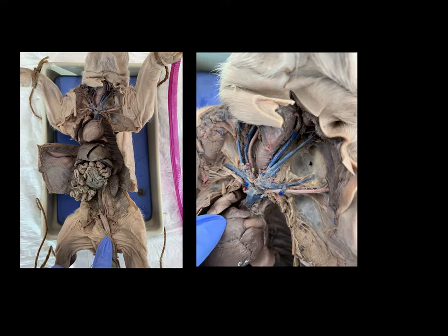Moving down our list is the brachiocephalic vein. Now on the pig, this is kind of tricky. We can see there's a lot of veins all kind of merging at one spot. Well, that one spot where all of those veins come together, that is the brachiocephalic vein. Right there. But why I say it's kind of tricky is immediately below that.